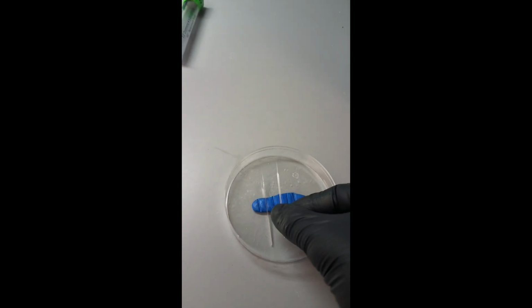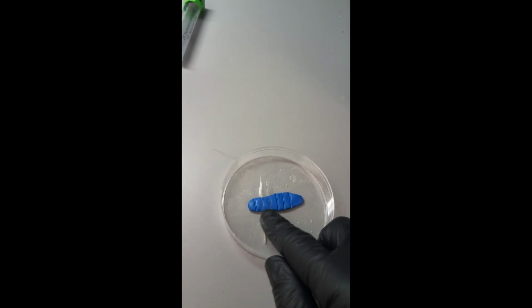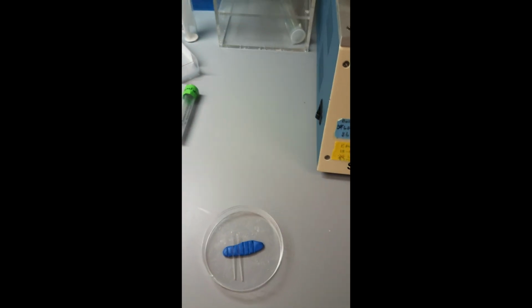Take the cover off. Just place it. Try to put the tip so that it's resting in the air. And that's how you pull a tip.